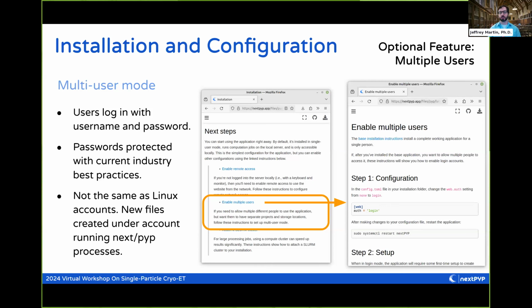I don't have time to go into that in too much detail today. But if you want a situation where the website is creating files under a certain user, there are ways to do that as well. And again, to find this documentation, you go to this next step area and you click on the Enable Multiple Users link, and it will take you to a document where you can learn how to set that up on your instance.